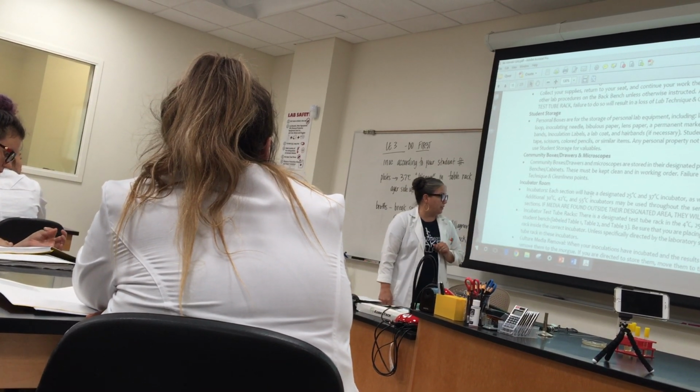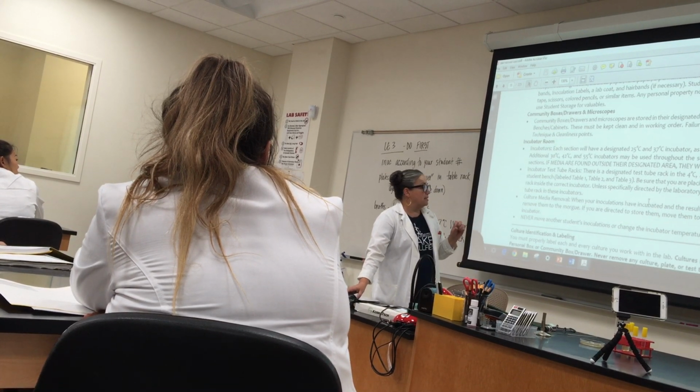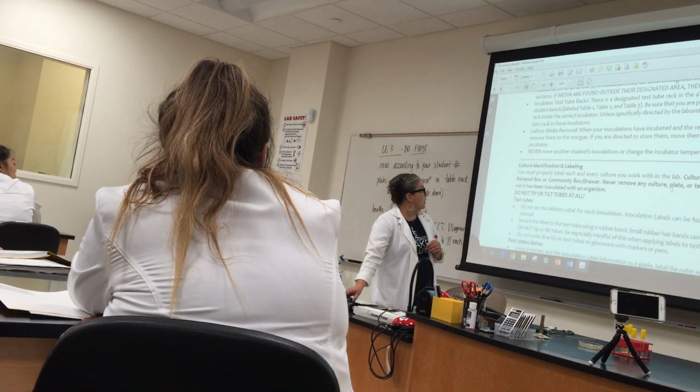So make sure you put them in the right place, and whenever we're done with things, right, we discard them in the morgue. We don't take them home as souvenirs, right? Because even though they're biosafety level 1 and 2, we still don't mess around with them, right?